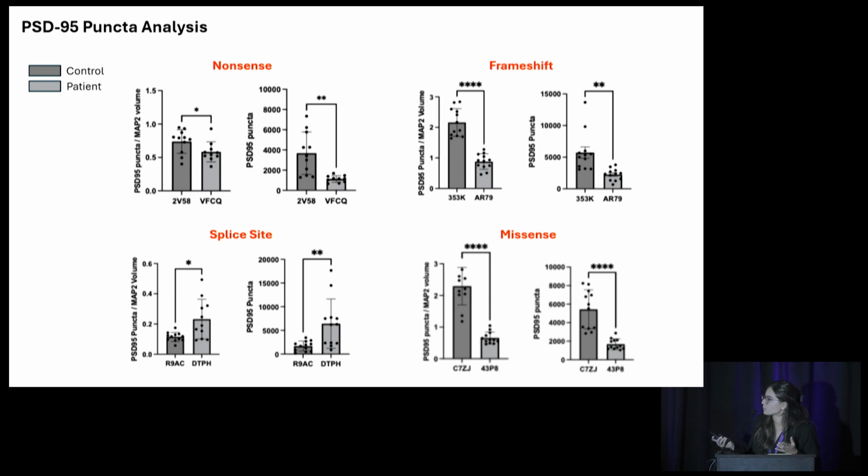Now, this is probably not the functional full-length version of the protein, but it shows that even a truncated isoform of this protein is still traveling to the dendrites. And that is an important notice that we should probably discuss later.